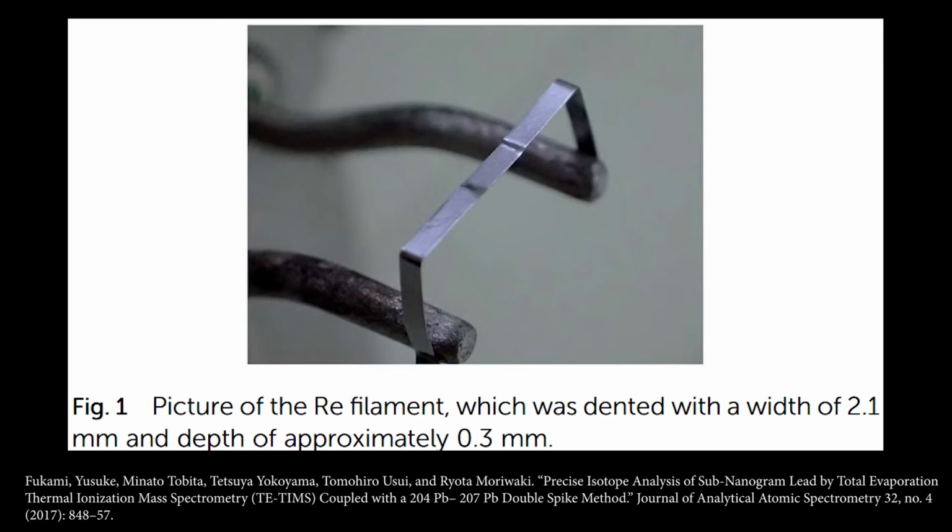You can go to 1,000 or 2,000 degrees, and this is going to cause the evaporation of the sample as atomic ions, just basically exposing it to very, very high temperatures, hence the term thermal ionization. So this is kind of an alternative to ICP when you're looking specifically at isotope ratios. It's a bit of a specialized application, but it's very, very popular in nuclear forensics. It is the go-to method for looking at plutonium, uranium, and thorium in nuclear forensics. It's an extremely important method for that field.